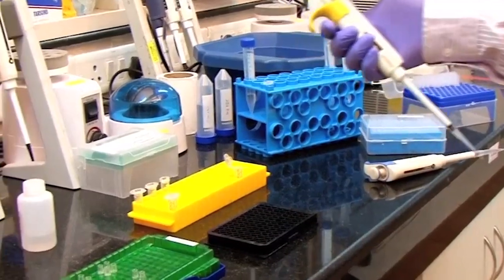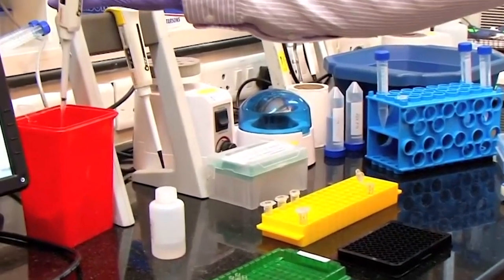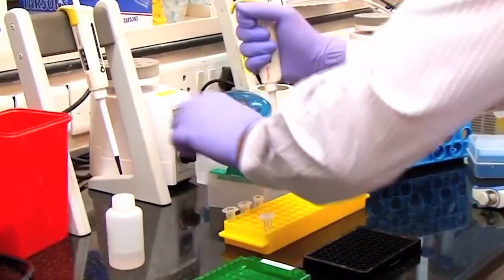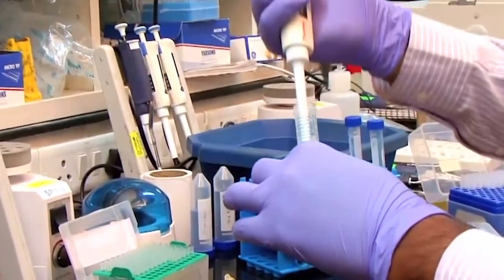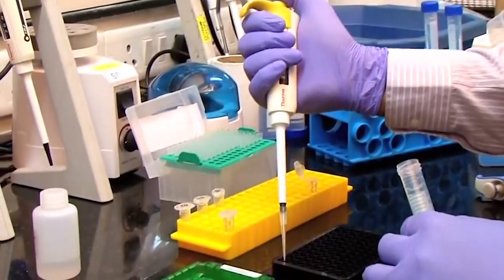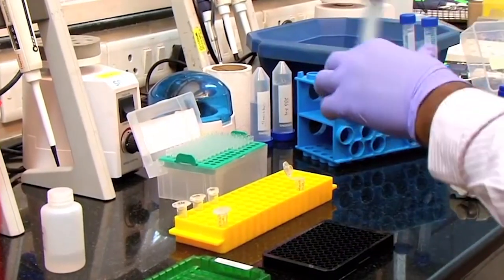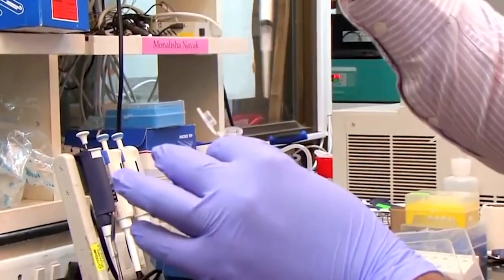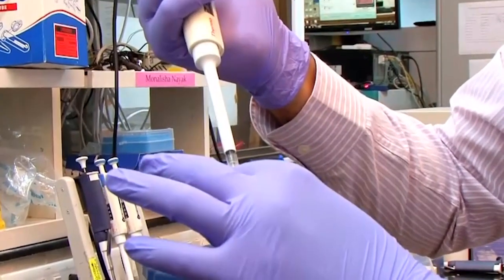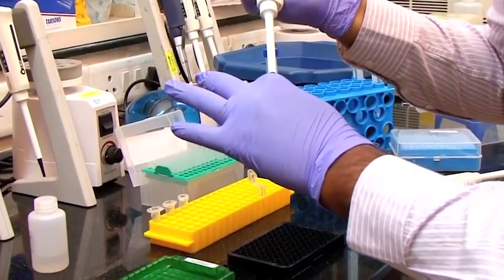Now I am going to demonstrate how we are going to immobilize the anti-apolipoprotein onto the streptavidin sensor. I am taking 200 microliter of the 1x PBS buffer, which is prepared. I'm going to add 200 microliter to each well of the 96 well plate. Now this is the biotinylated anti-apolipoprotein. I'm going to add 200 microliter of the biotinylated anti-apolipoprotein to the 96 well plate.